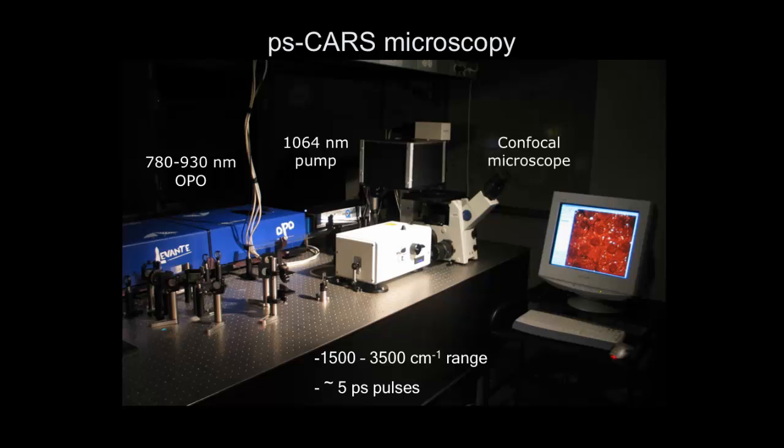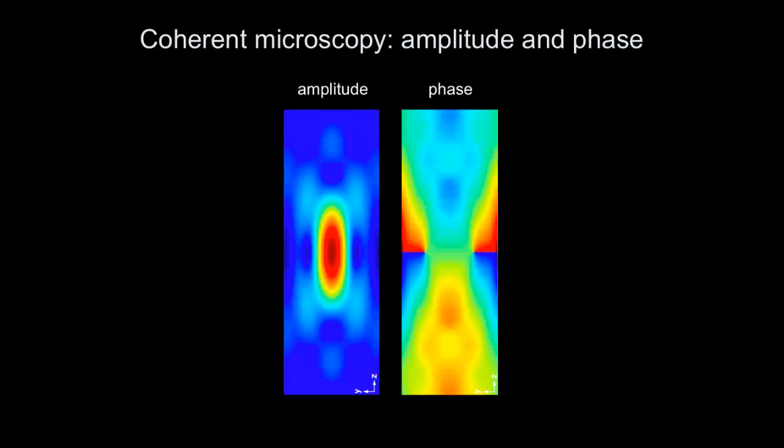In fact, you can do all these things at the same time. Okay? Here are the ultra-fast lasers, some limited optics. All of the magic happens in this laser scanning microscope. Now, the interesting thing is that this coherent Raman technique is truly coherent.